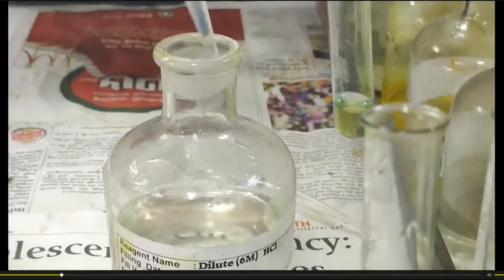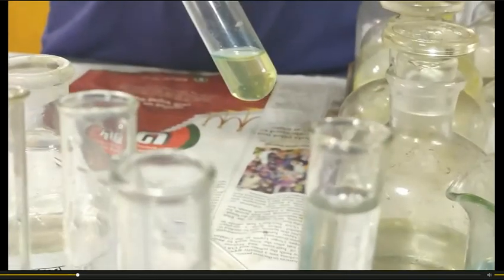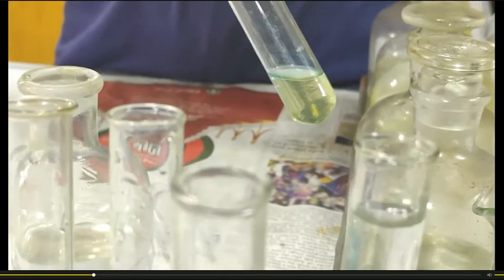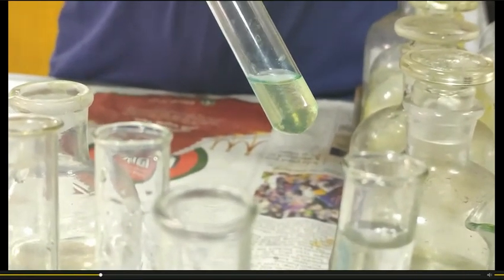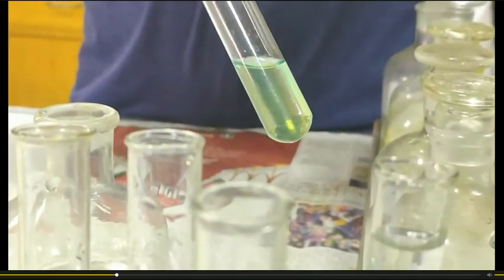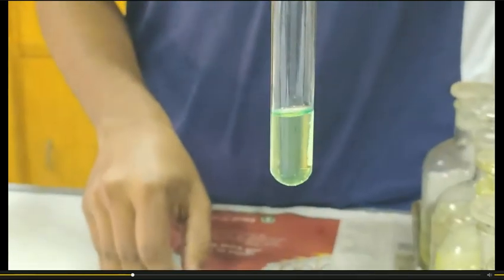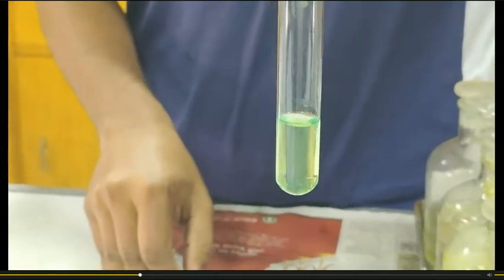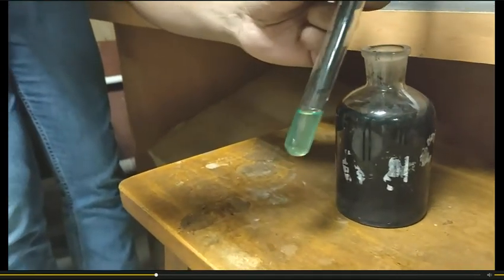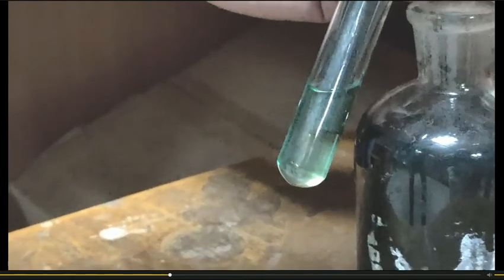If a precipitate appears, then it would be indicative of the presence of group 1 cations. If the precipitate does not appear, then it may be group 2, group 3, group 4, etc. The precipitate didn't appear, indicating that group 1 cations are absent. Now we are going to apply hydrogen sulfide gas into this test tube. If a precipitate appears, then it would be indicative of the presence of group 2 cations. Now we are applying hydrogen sulfide gas into this hydrochloric acid containing sample solution.